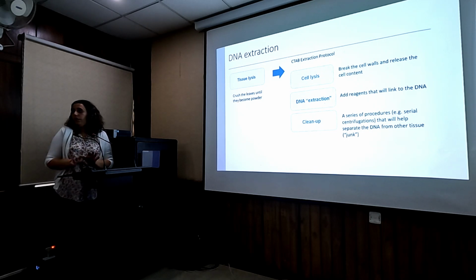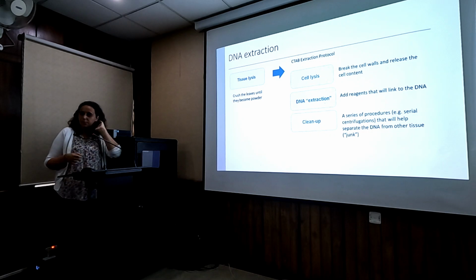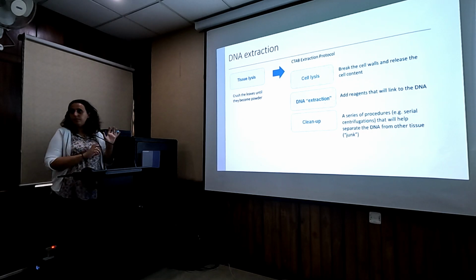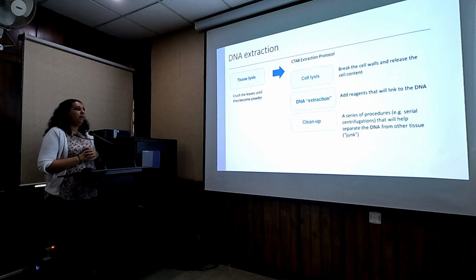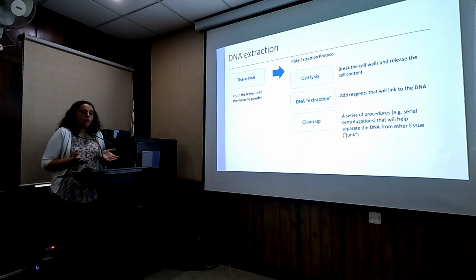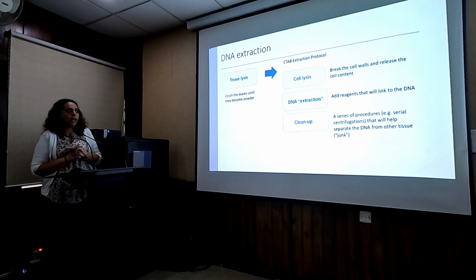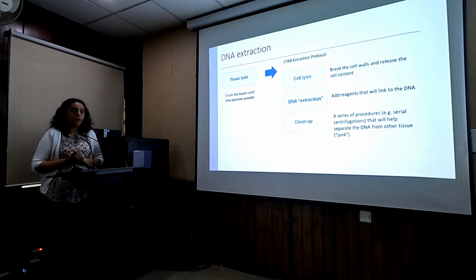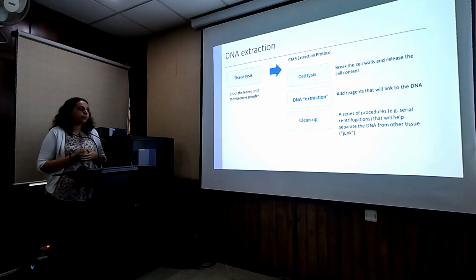In Gesneriaceae, you can't use the buffers and all that part from the kits because we get no DNA out of it. There's just too many phenols in it, all sorts of secondary metabolites, because many species are medicinal. So we have to tweak everything manually, so we can't use this part from the kits. But this is called the CTAB, normally people use the CTAB extraction protocol, and this is what you will see in the literature, and often you will see the CTAB modified protocol.